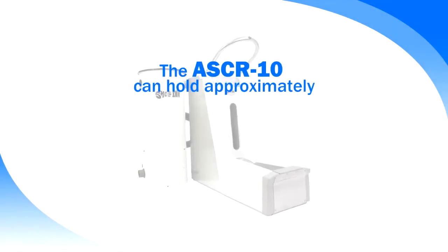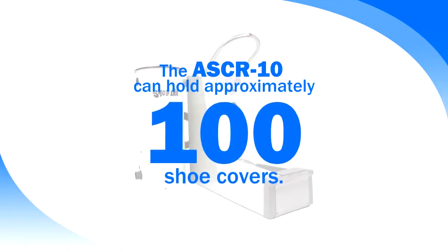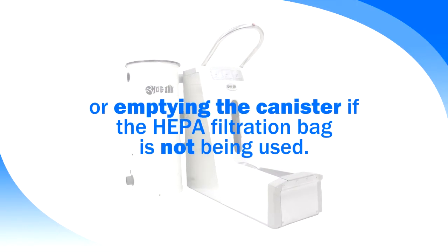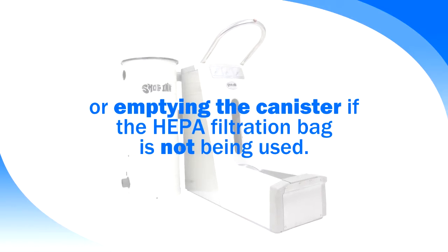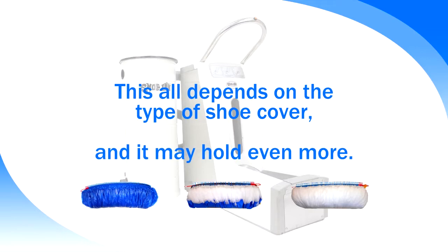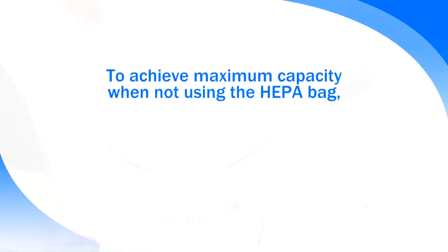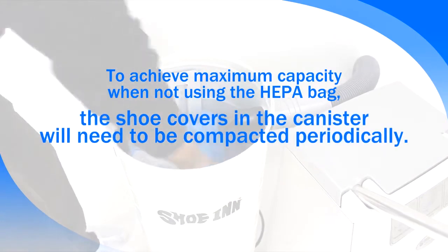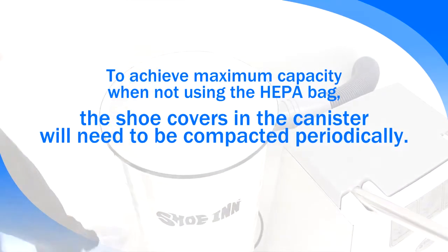When used properly, the ASCR 10 can hold approximately 100 shoe covers before needing to replace the HEPA filtration bag, or emptying the canister if the HEPA bag is not being used. This all depends on the type of shoe cover and it may hold even more. To achieve maximum capacity when not using the HEPA bag, the shoe covers in the canister will need to be compacted periodically.